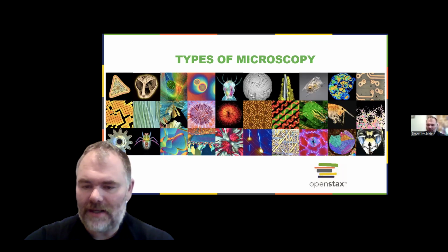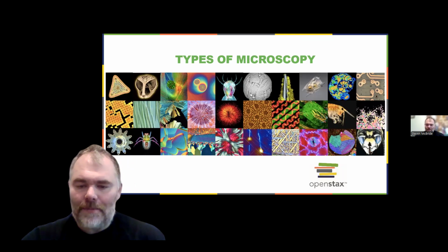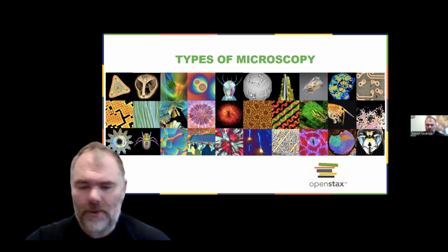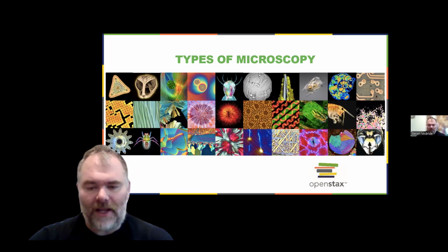Some microbes are nearly transparent and difficult to see without staining. Others are alive and moving, meaning stains or harsh preparation techniques could damage them or alter their behavior. And some structures, like viruses, ribosomes, or cellular membranes, are simply too small to resolve clearly using visible light alone.